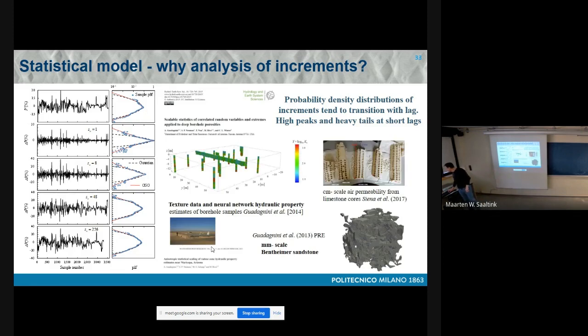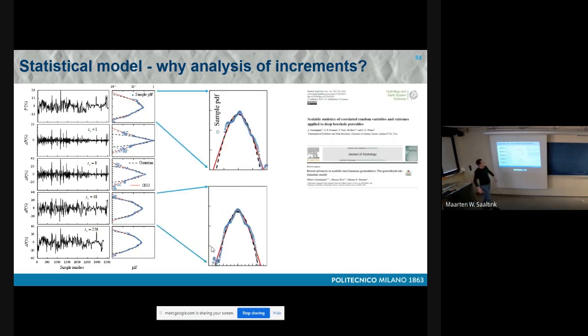We saw this kind of behavior in several data that we analyzed. The key point being that at some points we could, even for other variables, distinguish these 3 peaks in the distribution of the increments. And to be honest, in this case, we used the model which basically ignores the distribution of these two lateral peaks. We were not using a Gaussian mixture model.